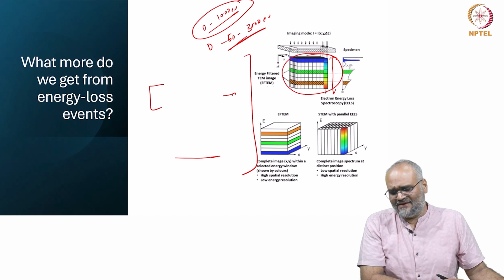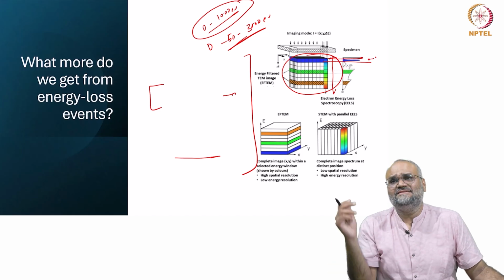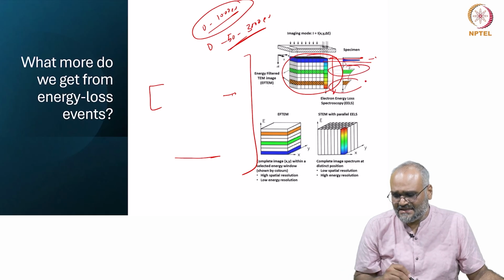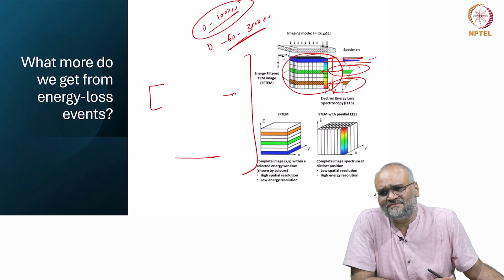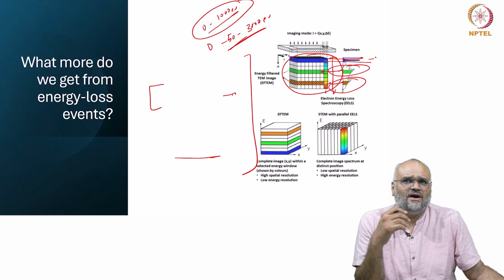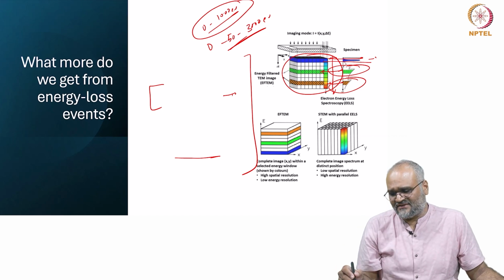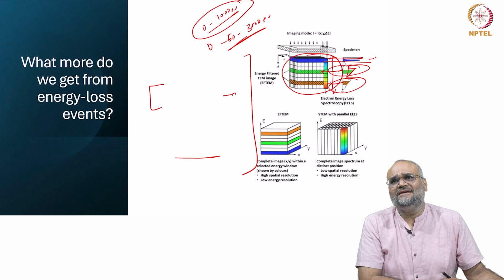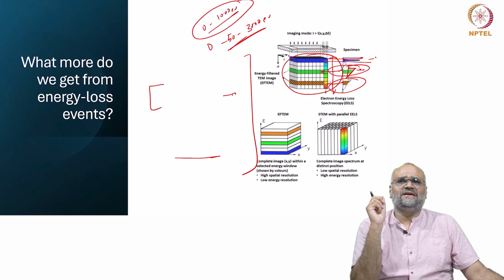The electrons that have not lost much energy pertain to the so-called zero loss peak area, and when there are ionization edges corresponding to specific elements and their transitions, whether it is a copper L23 transition, or a nitrogen or carbon related transition, you have specific ionization edges which look like these triangles once you exceed a certain critical threshold energy.